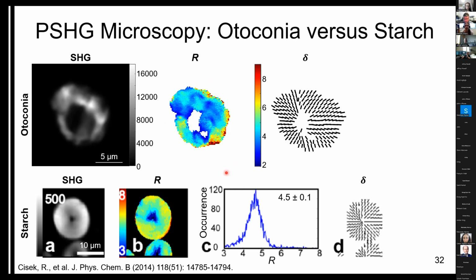One study, using transmission electron microscopy on mouse otoconia, found that there was an abundance of a particular otoconia protein, otoconin 90, around the nucleation region that has an altered structure as compared to the outer edge. So maybe this is also causing this effect. So the next step in this project is to study how various degradation conditions such as EDTA alter the fibrillar protein structure within otoconia, as well as to see if we see any differences in otoconia dissected from mice of different ages.